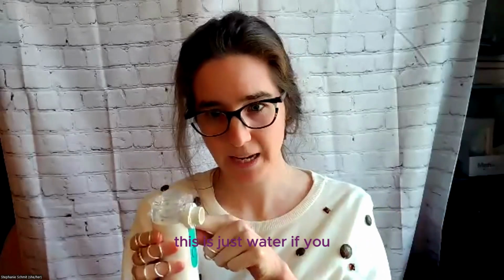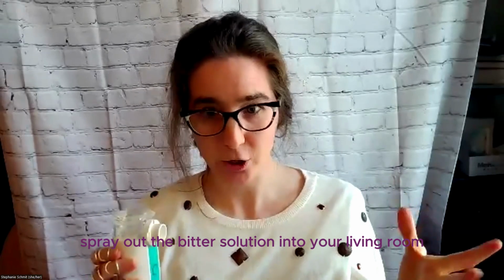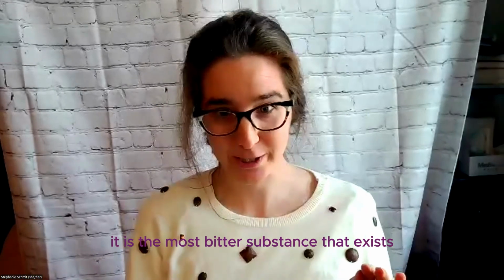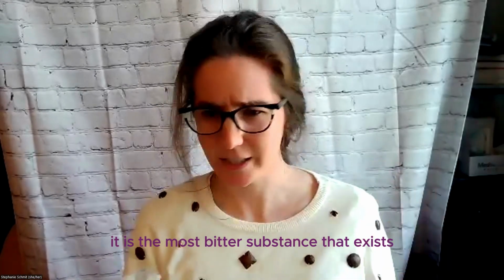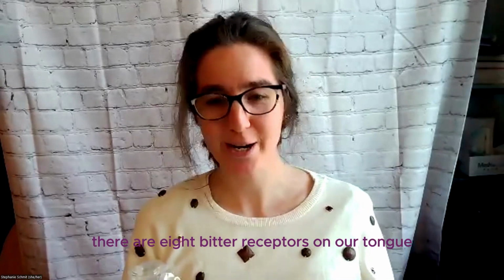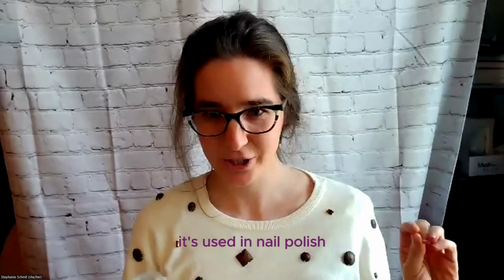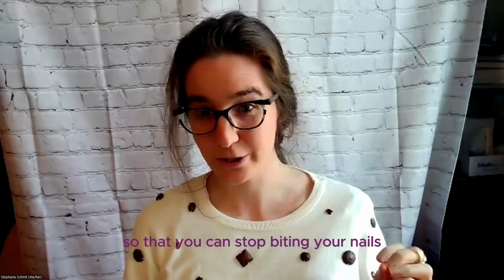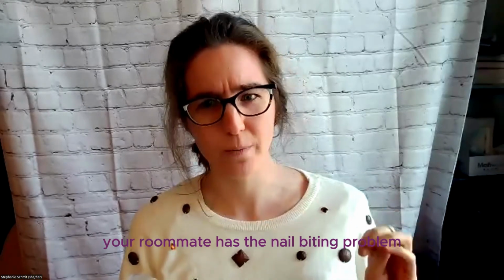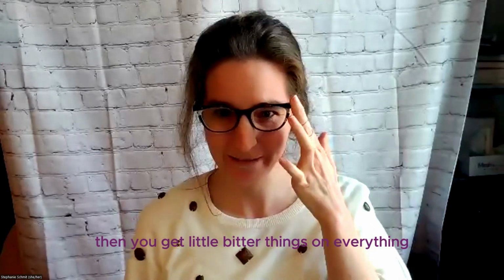Any liquid in here sprays out a fine mist. This is just water. If you spray out the bitter solution into your living room, you will be tasting bitter. The bitter is very bitter. It is the most bitter substance that exists. As far as I know, there are 8 bitter receptors on our tongue that all respond to the Bitrex. It's used in nail polish so that you can stop biting your nails. It's really bitter. It's gross. Then it gets on everything. So if your roommate has the nail biting problem, then you get little bitter things on everything.